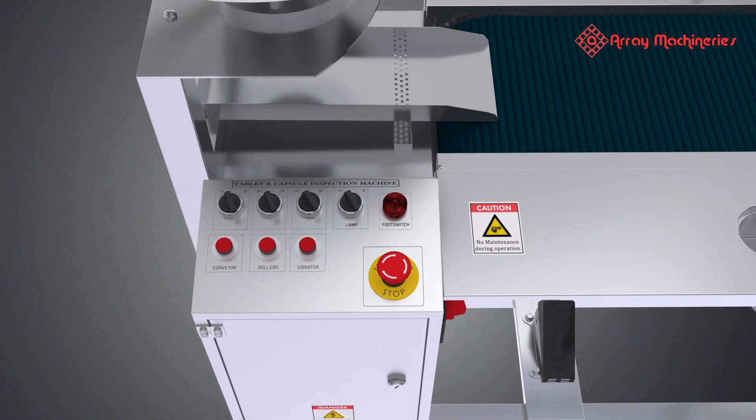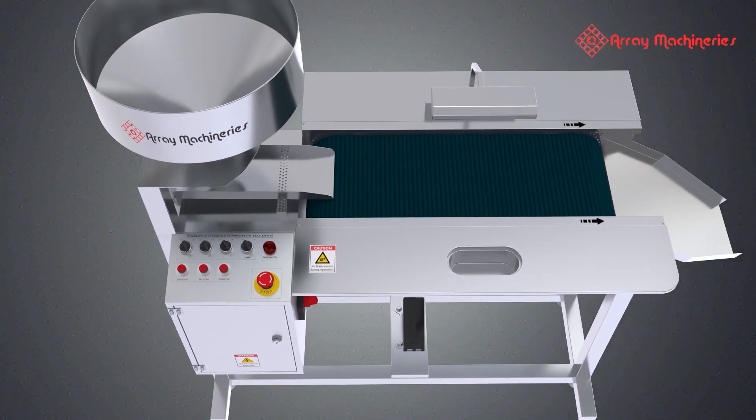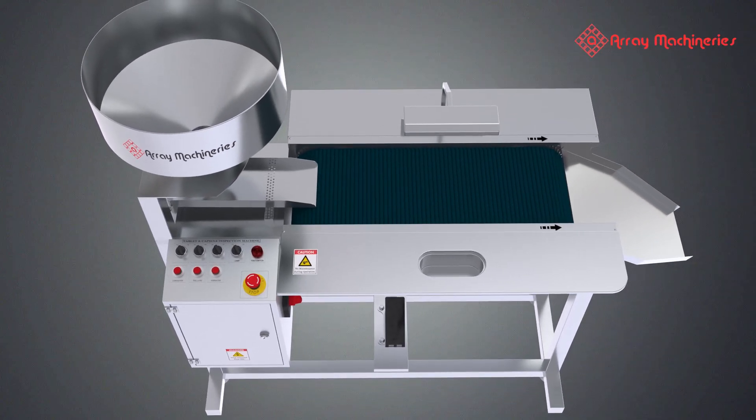Proper illumination is provided on the top side of rollers for easy detection of defects for the operator.